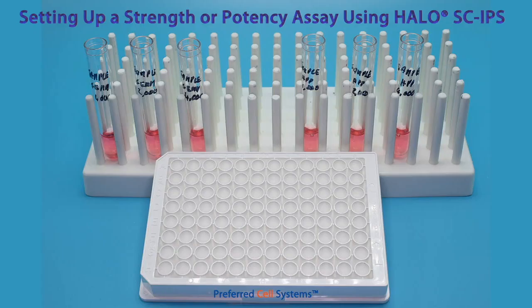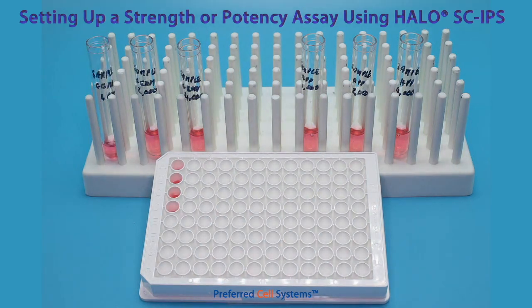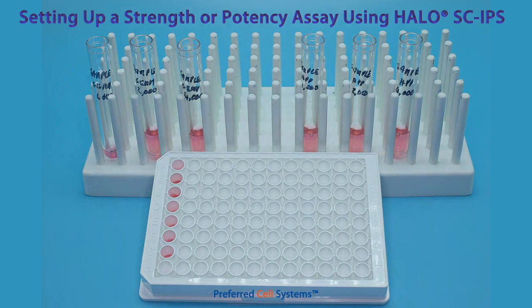Using a single channel pipette, the wells of the first column of the sterile 96 well plate included with the assay kit are each filled with 0.1 milliliters from the lowest SC-IPS sample cell dose. This reduces the lowest cell concentration another tenfold, down to 1,000 cells per well. In other words, you are preparing 8 replicate wells for each cell concentration.